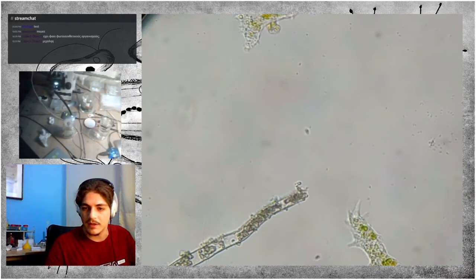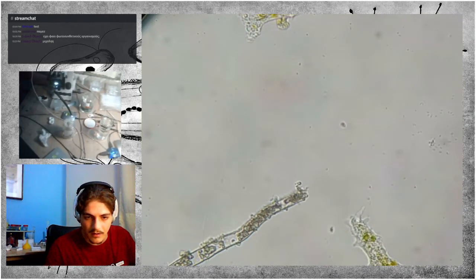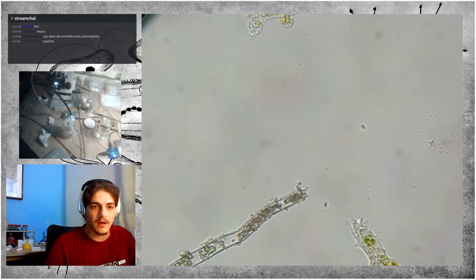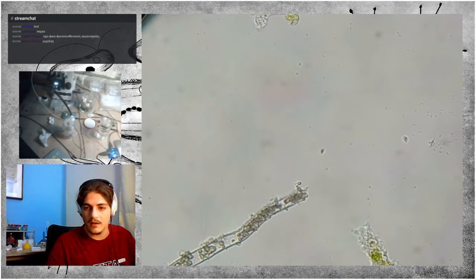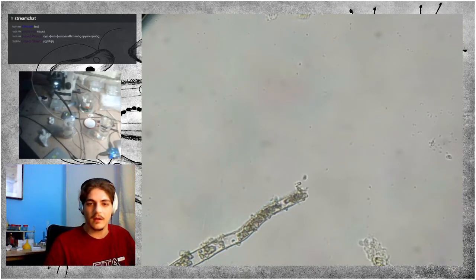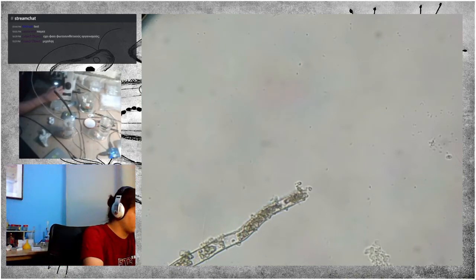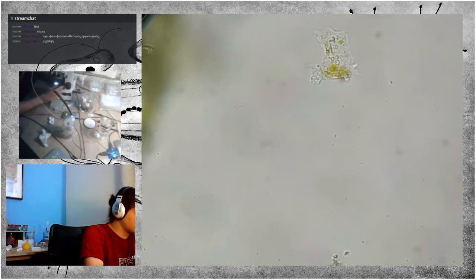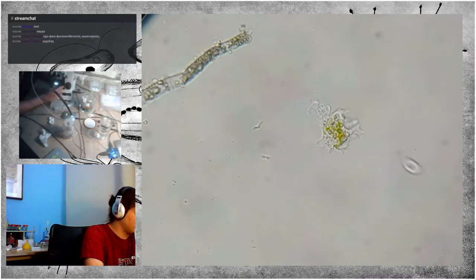Let me check a thing first. Okay. So these two are probably the same species of amoeba.